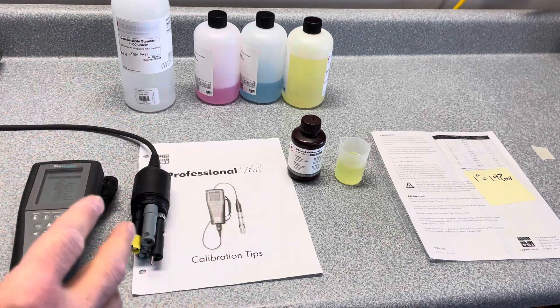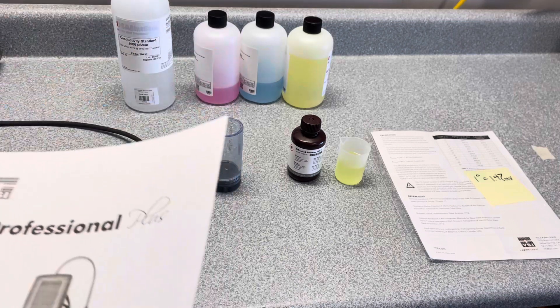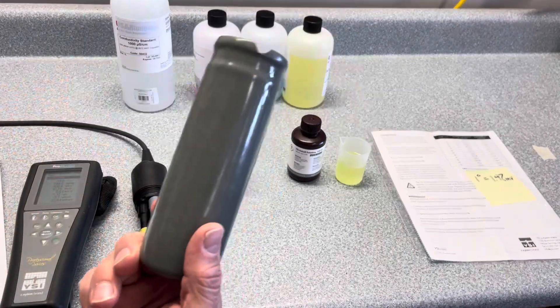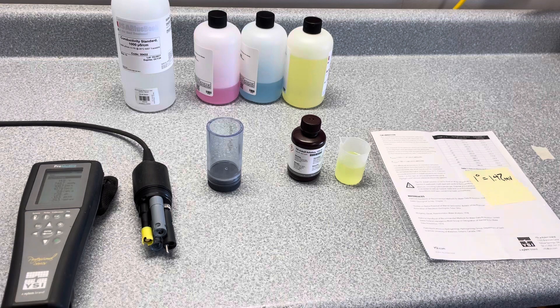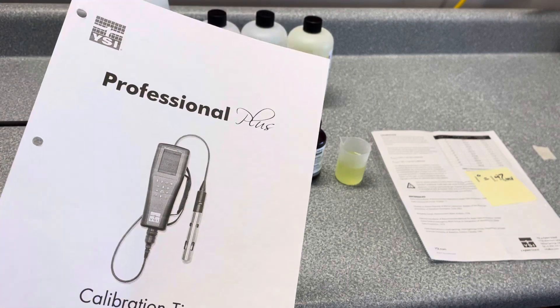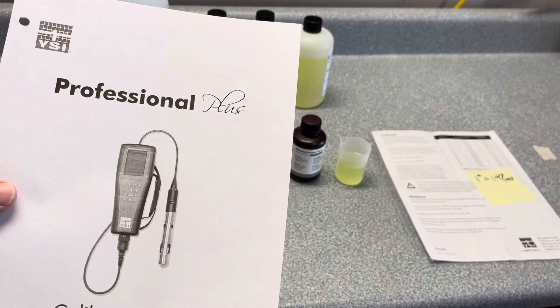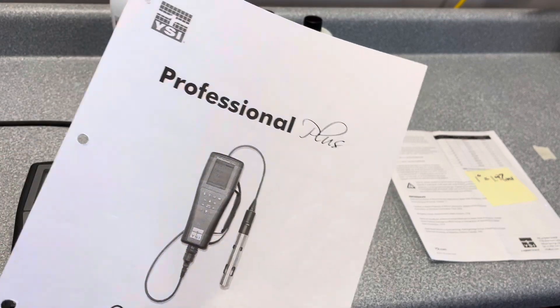Some of the things that you're going to need for calibration will be the calibration cup for the ISC sensors, and then you're going to use the calibration sleeve that has a sponge in it for calibrating DO in the 100% humid environment. It's very handy to download the Professional Plus calibration tips, which is extremely helpful along with the owner's manual that can both be downloaded from YSI.com — just go find your particular meter.